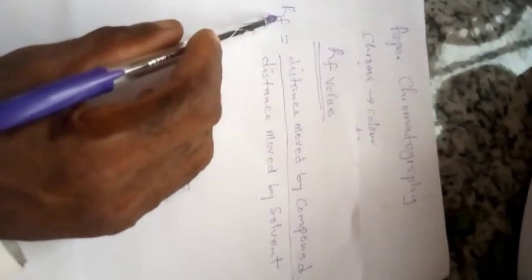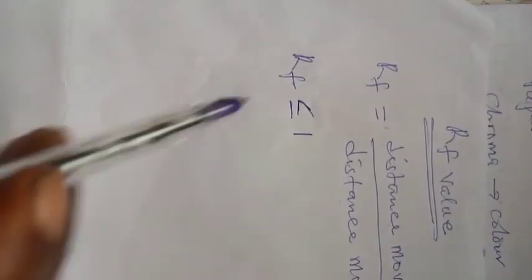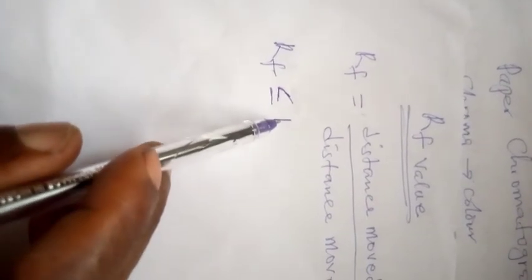RF means retention factor is equals to distance moved by compound over distance moved by solvents. RF value is always equals to or less than 1.